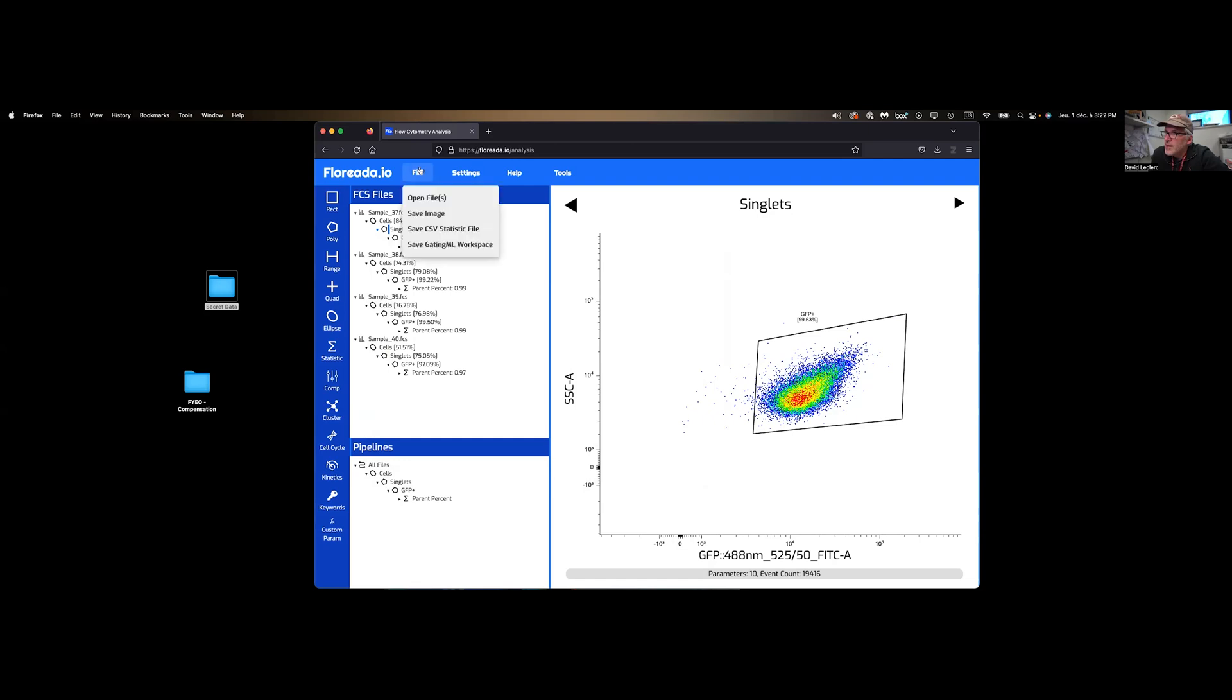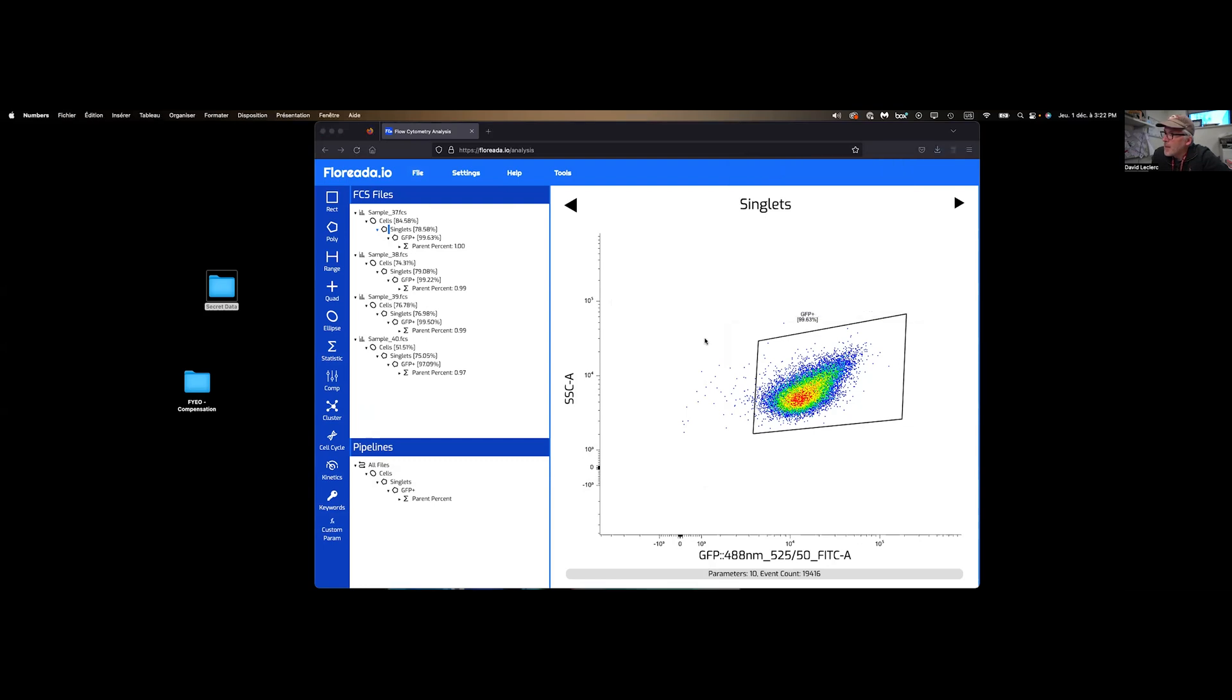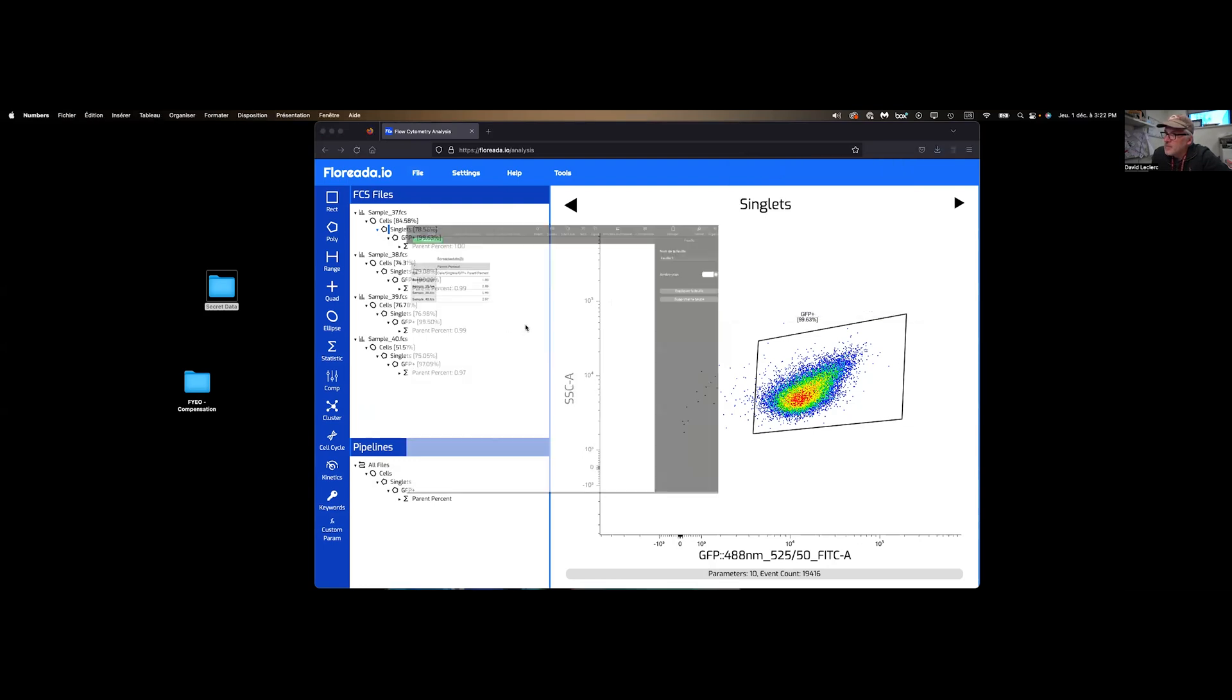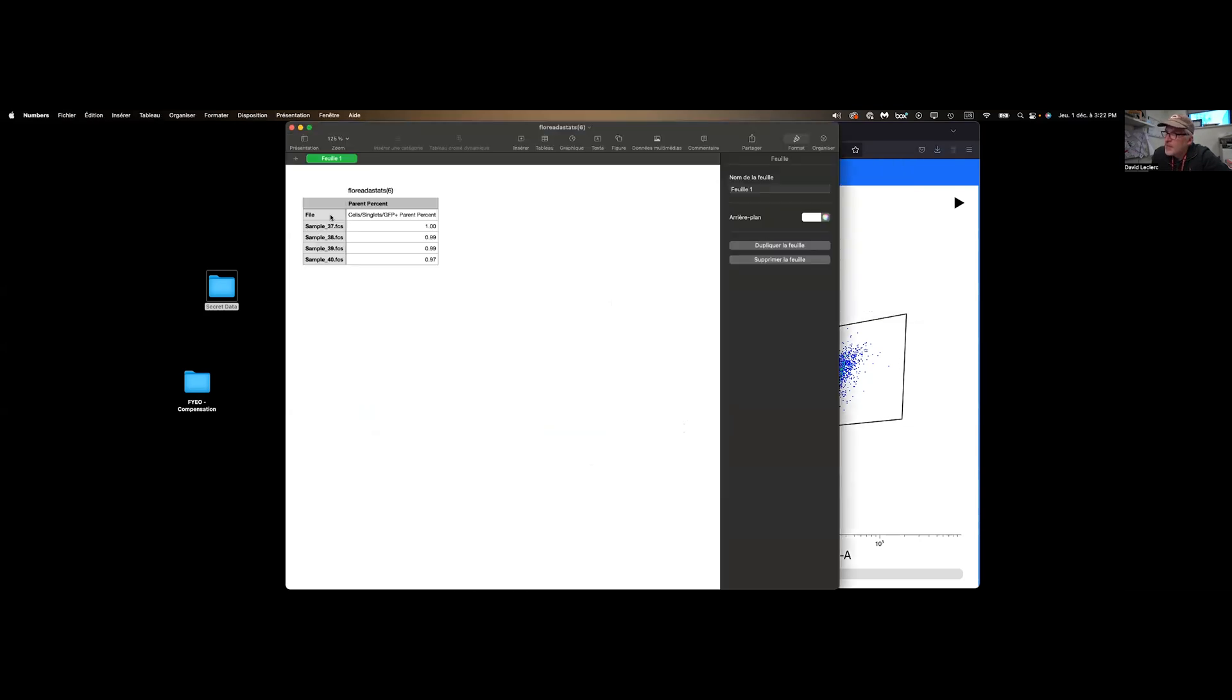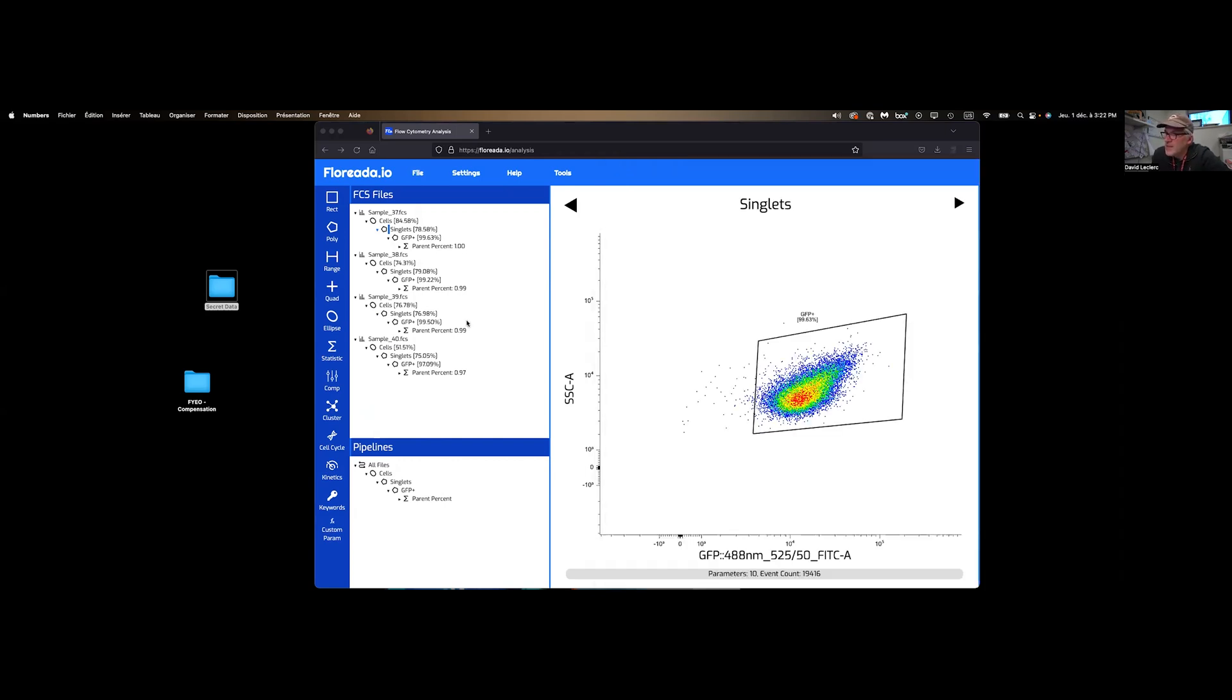Next, we can export the CSV statistic file. And now we have my sample name with the percentage. The percentage comes from this statistic that I included. So this is why it's important to have that included in your analysis.